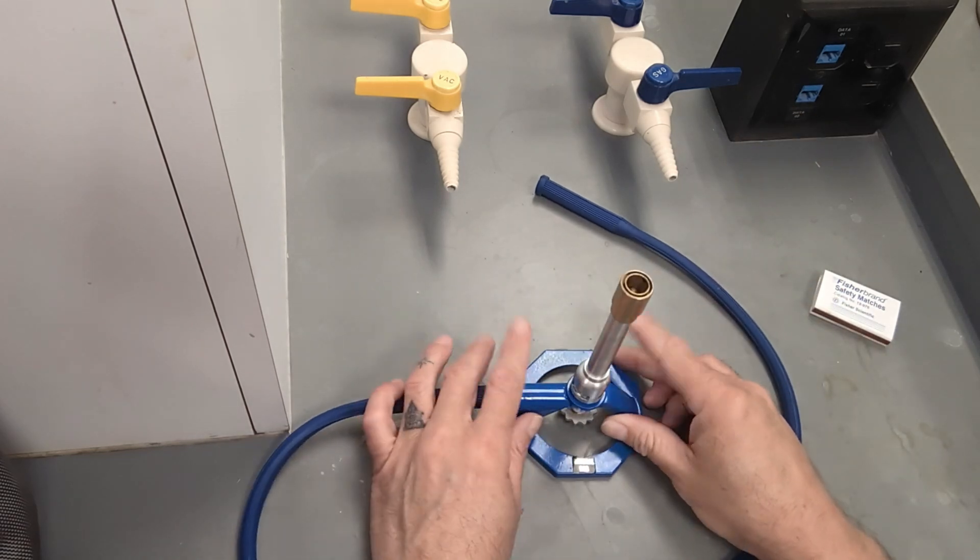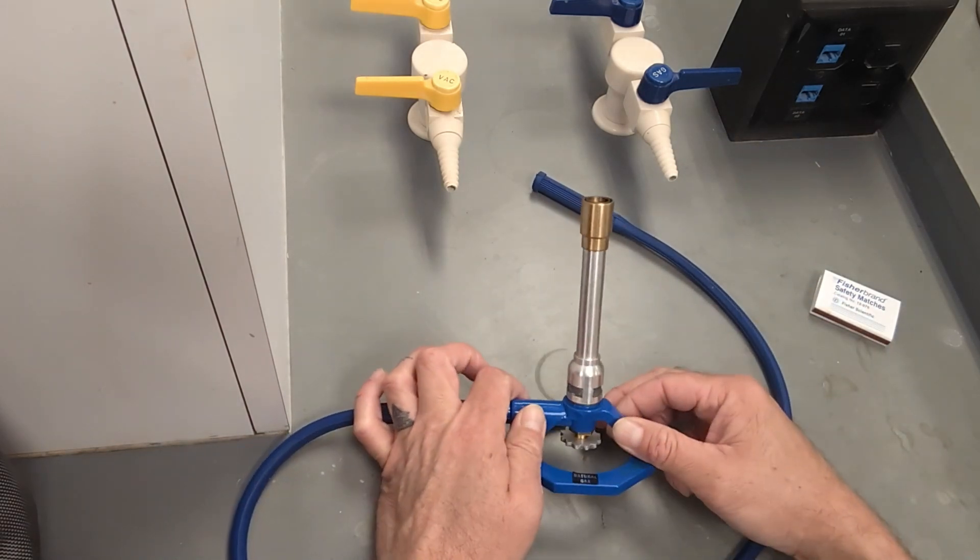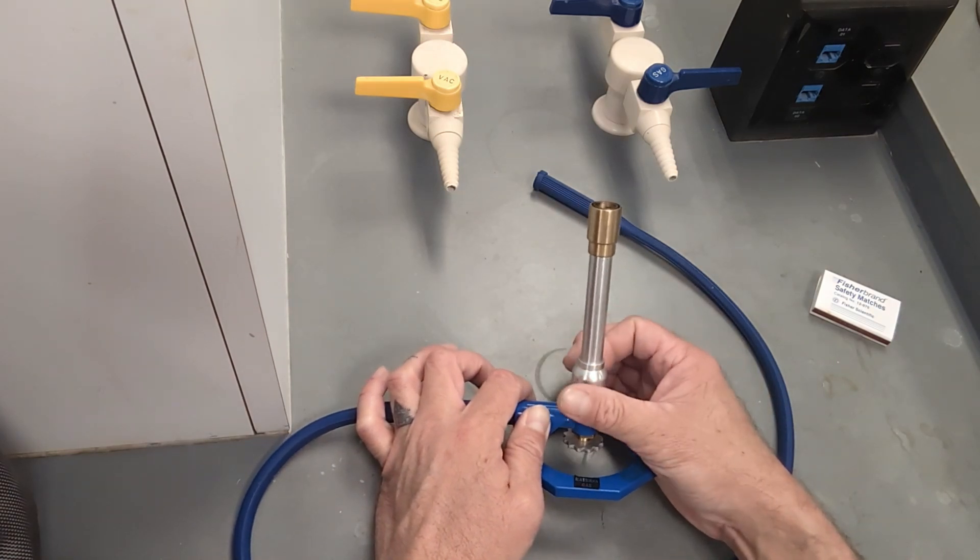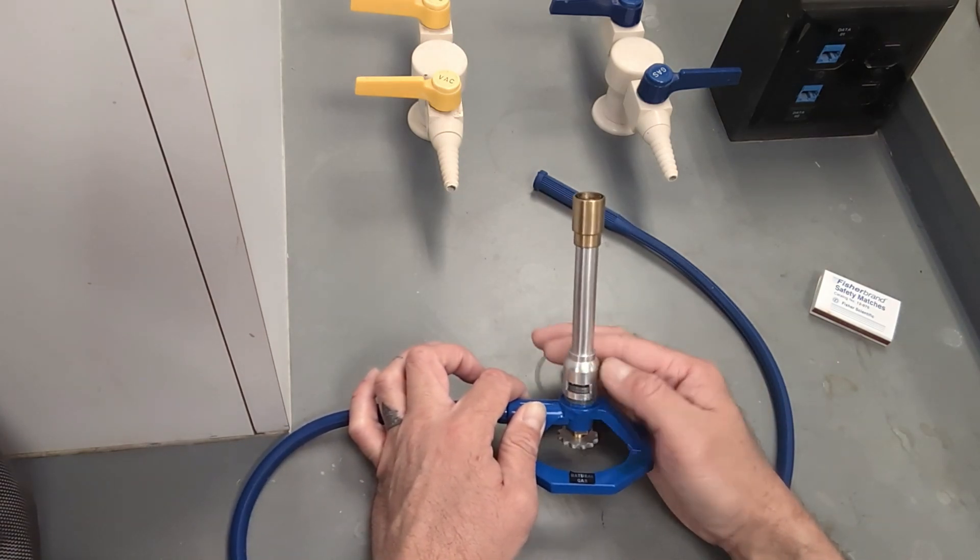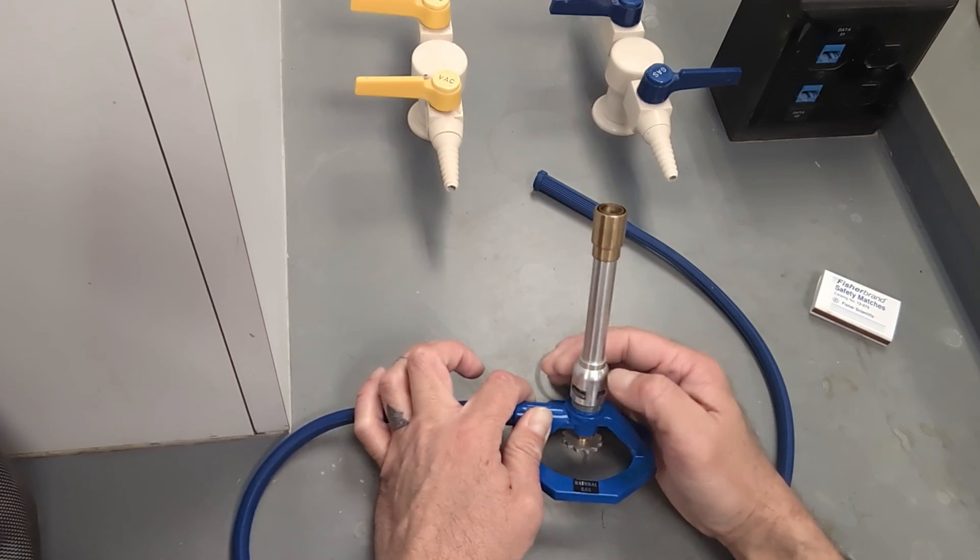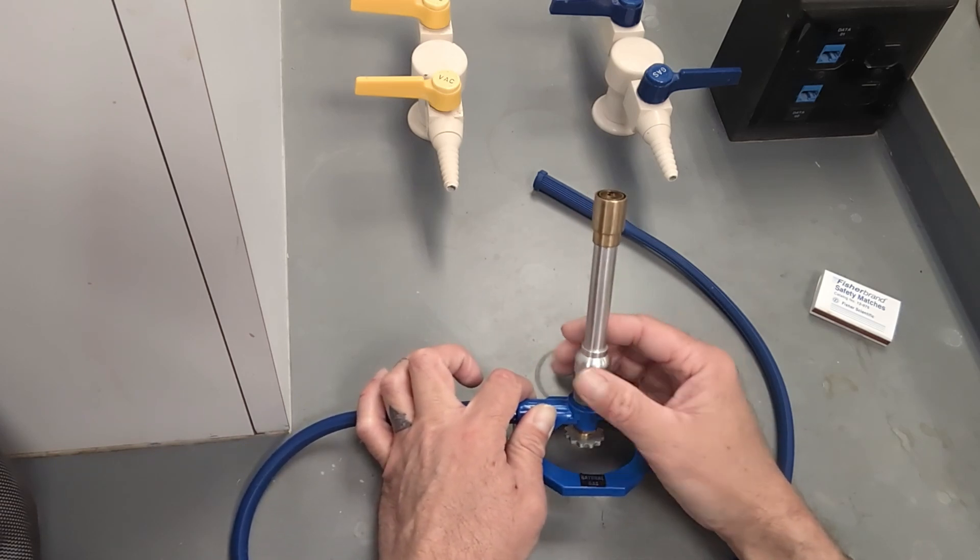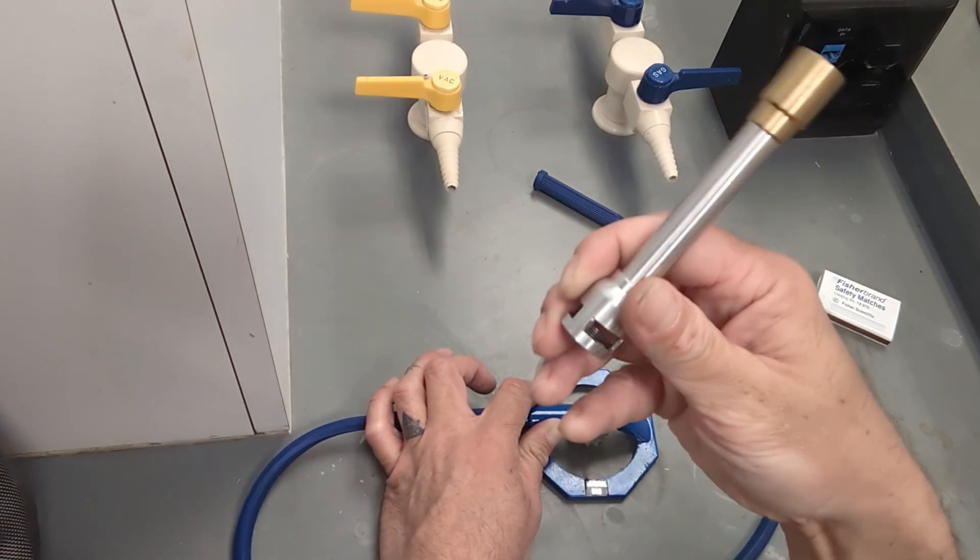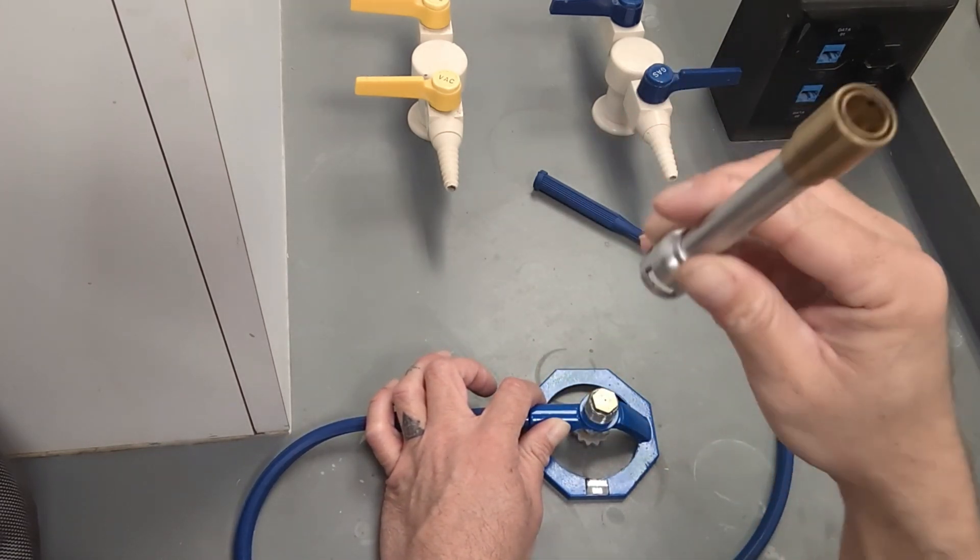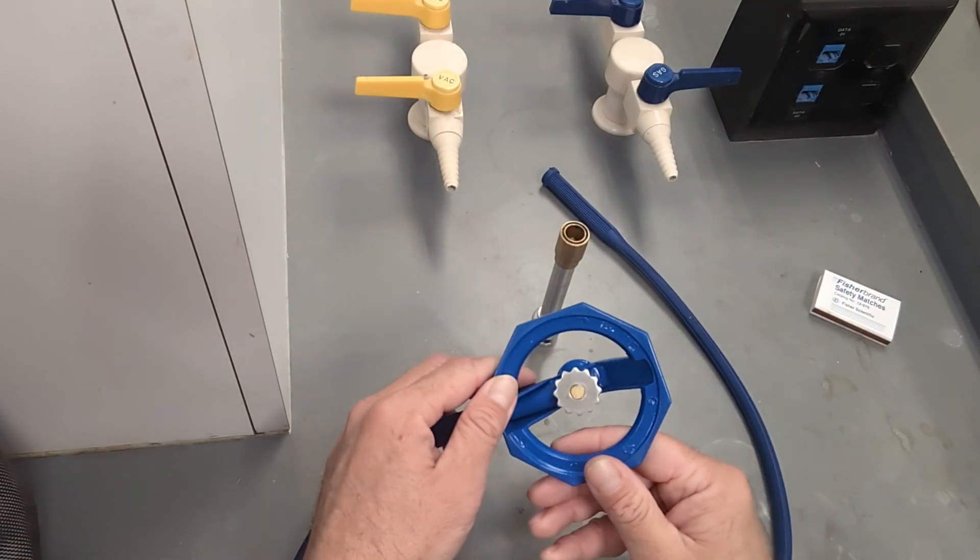The hose, as mentioned before, is used for gas flow. The collar can actually be loosened all the way. As you'll see here, it can come all the way off. And this is where the air flow will come through as the gas enters the Bunsen burner.